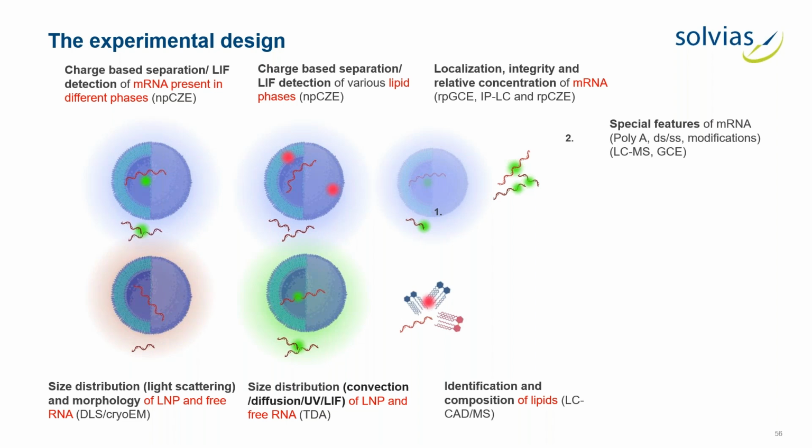And Taylor dispersion is so far under development here in-house. We don't yet have it under control, and we can at the moment not derive any conclusions, but we can use first results to compare different LNP systems, also in the context of all other techniques. And last but not least, the analysis with a focus on the RNA, of the unbound and free RNA, and also total RNA after degradation of the LNP system, using two methods, size-based CE and charge-based.